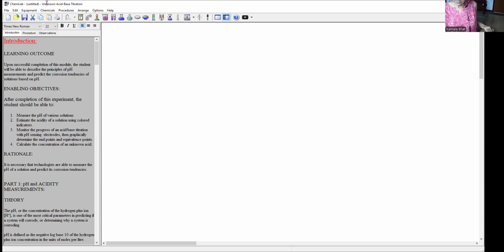Now, concentration can be expressed in terms of molarity, moles per liter, grams per liter, or in percentage. And they are all related to one another, where mole is defined as the mass of the acid taken over the molar mass of the acid, or it can be defined as molarity times volume in liters. So that conversion you will be able to use.